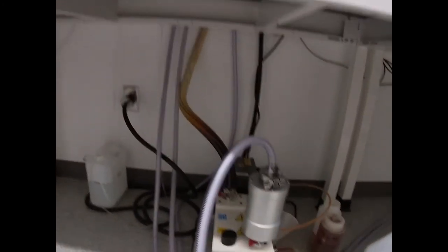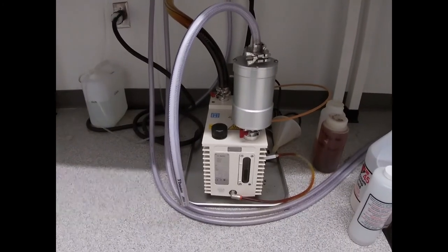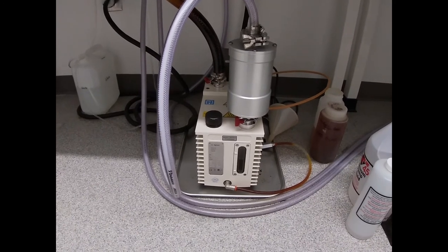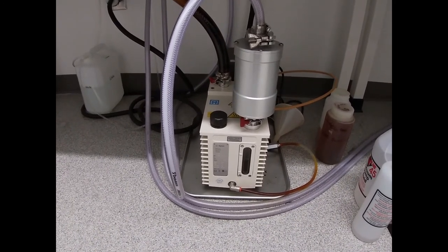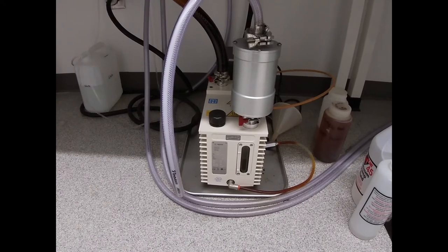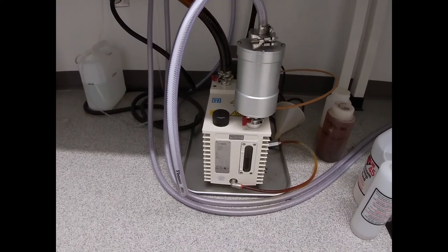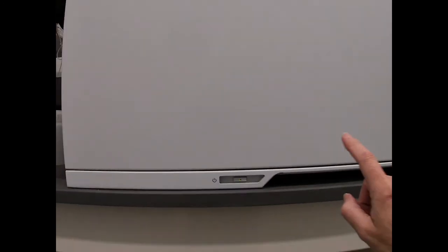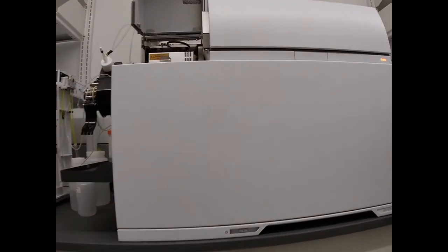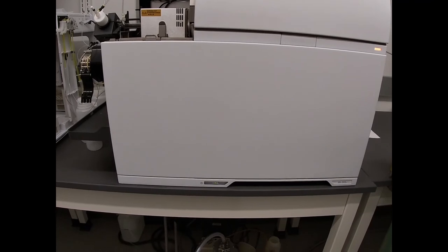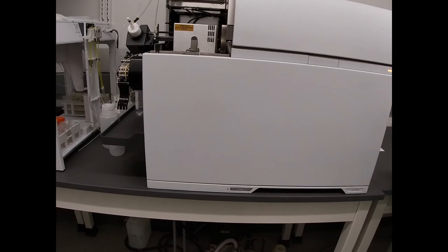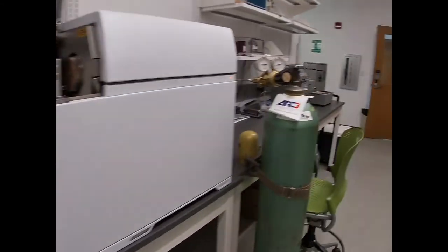So our vacuum system consists of a fore pump or a roughing pump. It is connected to the area actually between the sampler and the skimmer cone. So it pulls it down to a low vacuum around 10 to the minus three. And then of course we have a turbo molecular pump that's housed inside here. It pulls the mass spec chamber down to a high vacuum, 10 to the minus six Pascal.